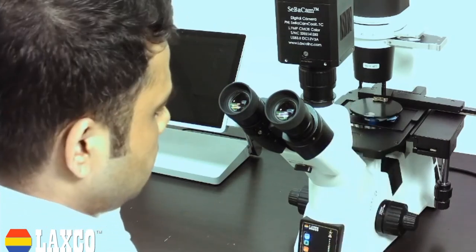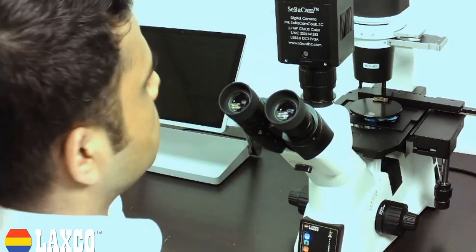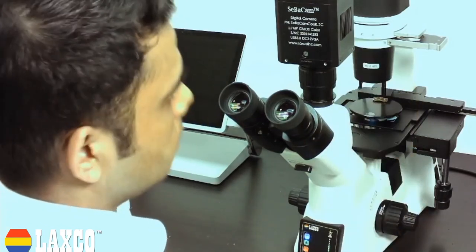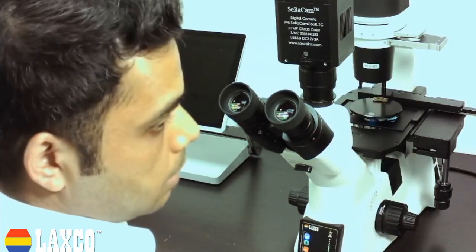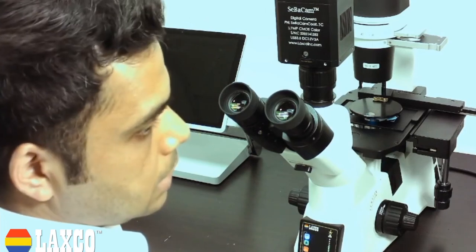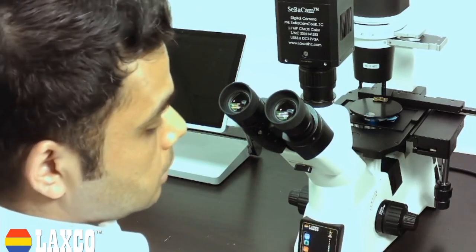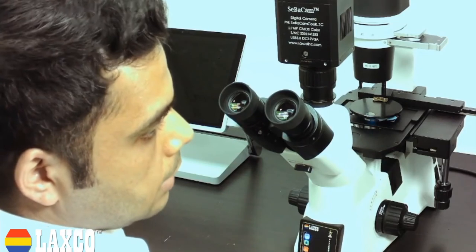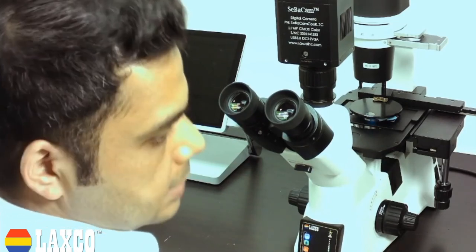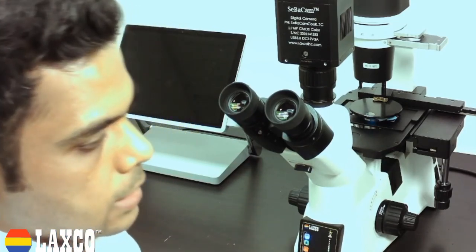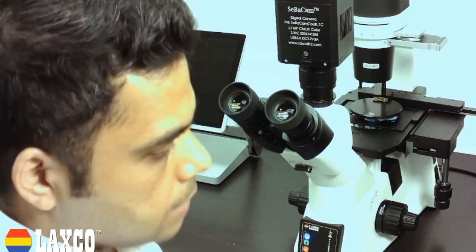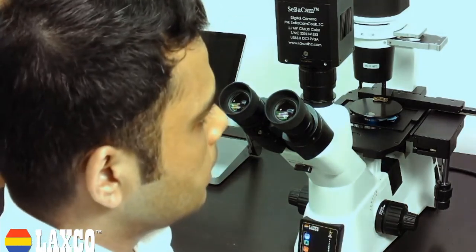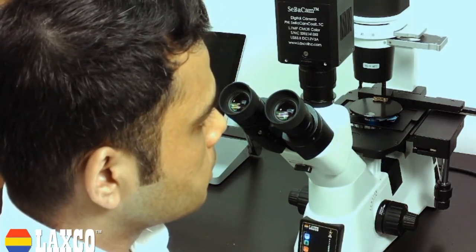If we also take a closer look at the system, you will find that I have attached a 1.7 megapixel color camera on this because we will see live color images. I repeat, we will see live color images. As I said before, let's look at some of these amazing images that I have taken of our sample here. Let me quickly switch over the screen.